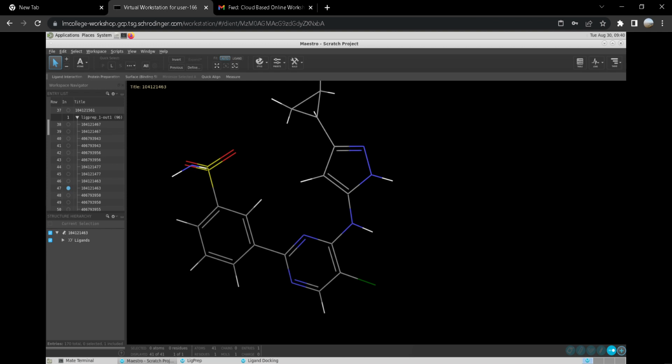If most of you say yes, then I can start the analysis, and in the meantime, the job will be over. If all of you permit, then I'll be able to proceed.